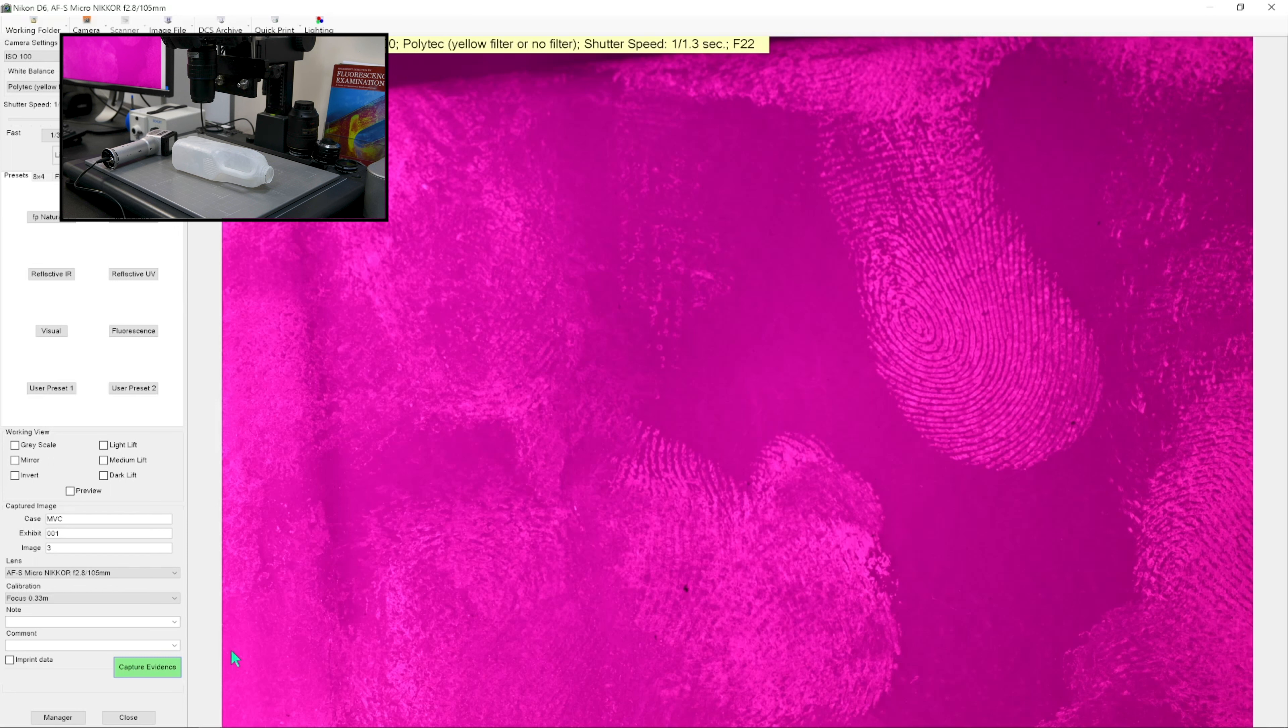When we use UV light on the bottle, this kind of white milk bottle, this white plastic surface is really fluorescent and so it just looks light blue.